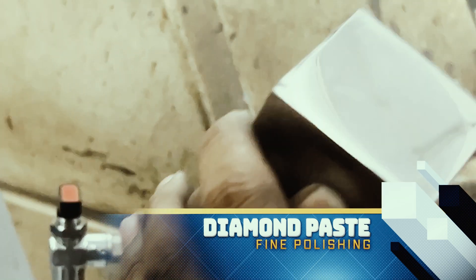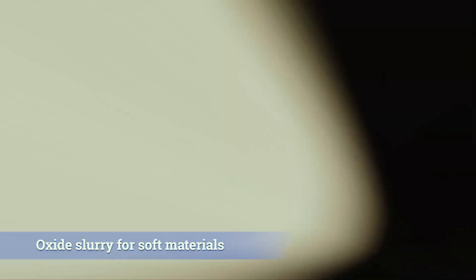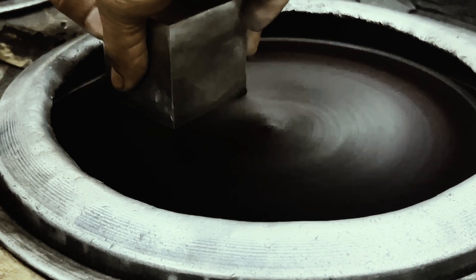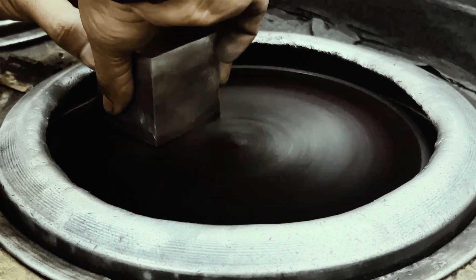An oxide slurry can also be used for softer steels and non-ferrous materials. The sample is carefully cleaned between stages to prevent contamination. Ensure that there is no excess heating or cold working during the preparation. This sample does not require any mounting.